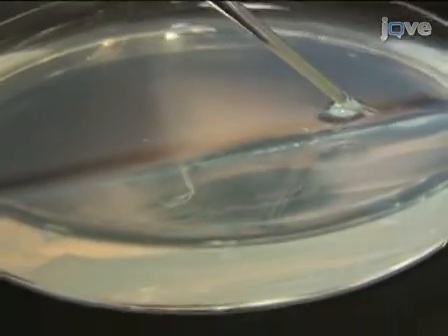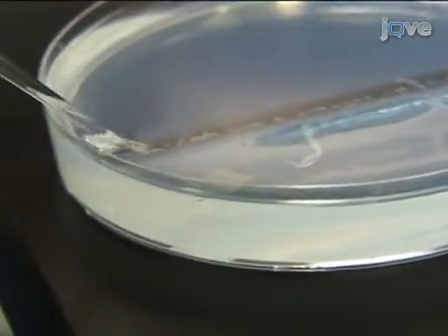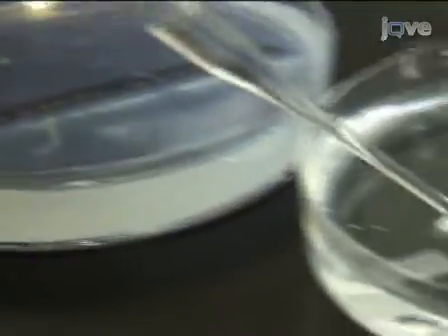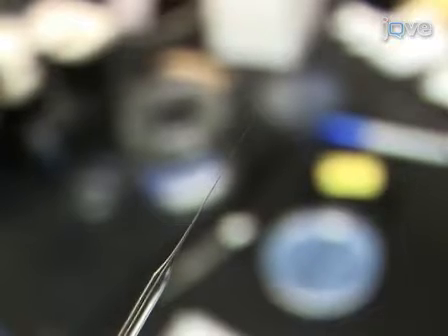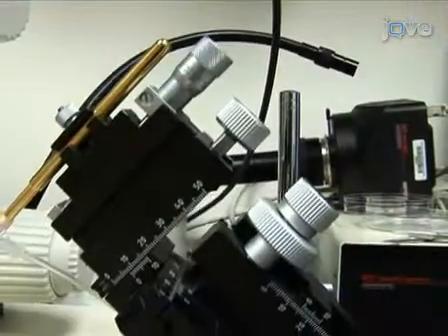And then we're loading them single file into this trough. Now the embryos are ready to be injected with lineage marker using a precisely calibrated, fire-pulled glass injection pipette and a pressure injection rig.